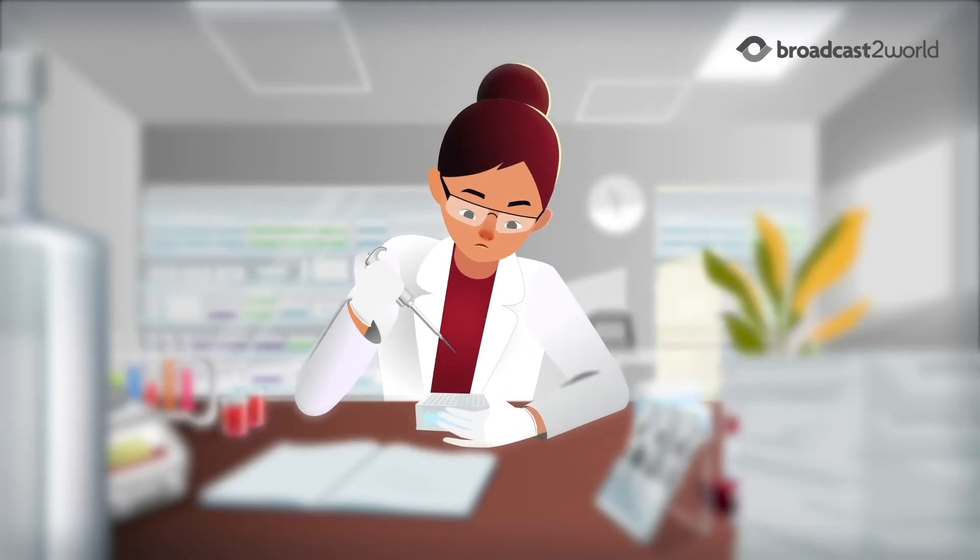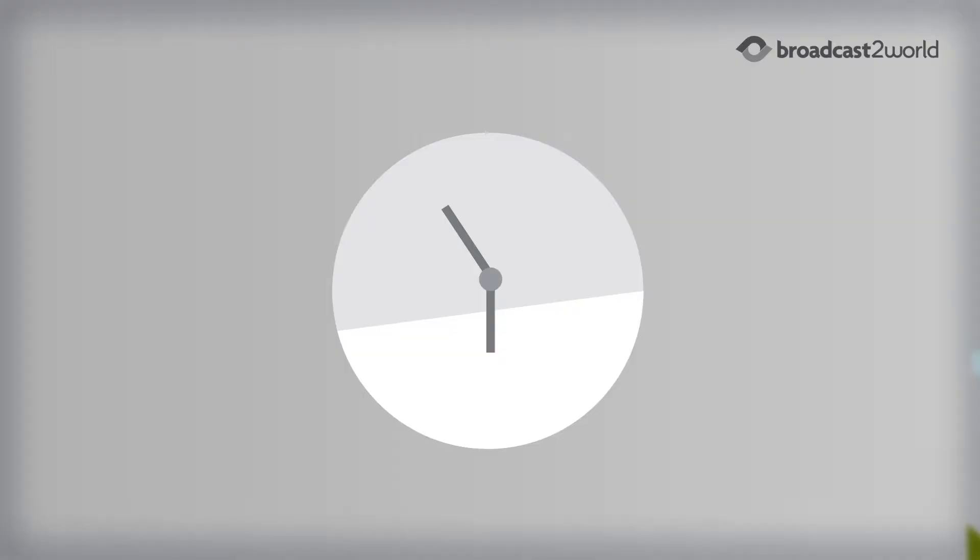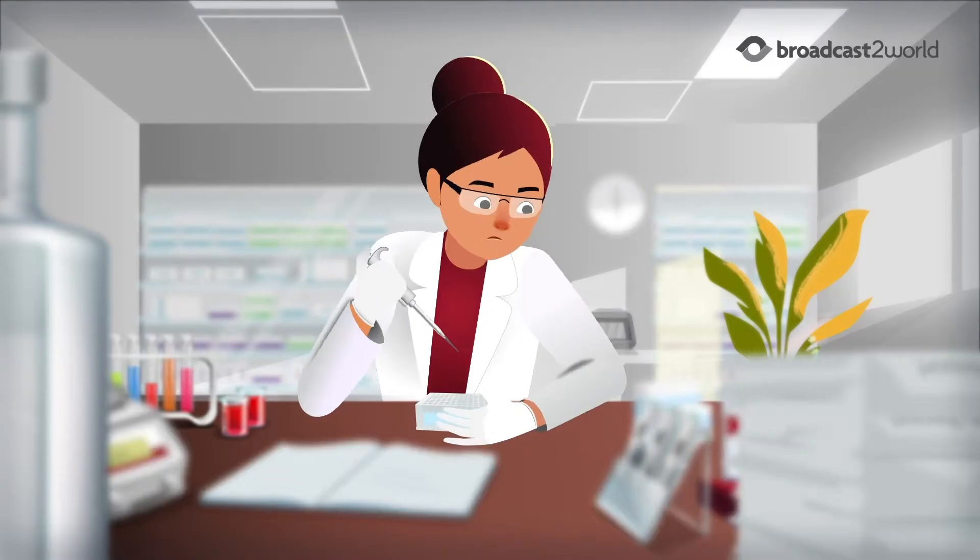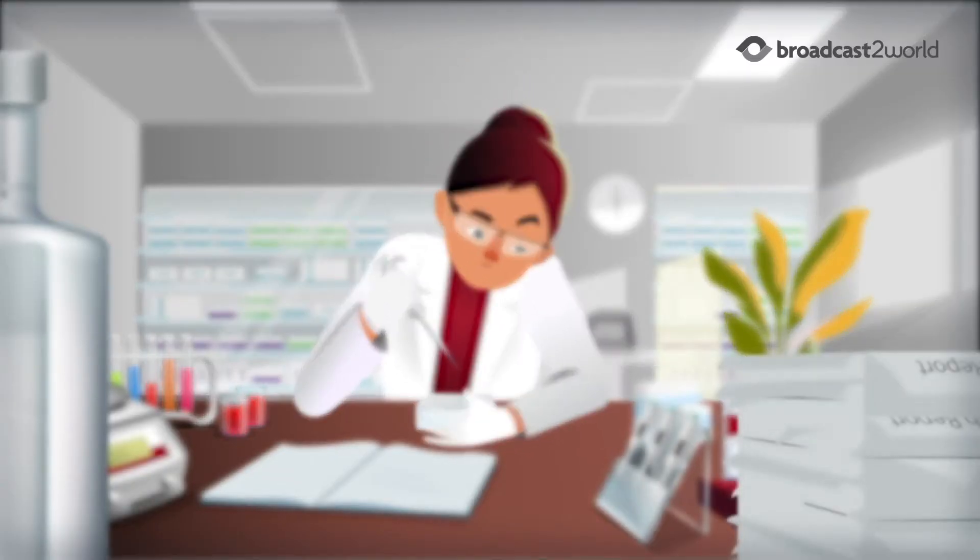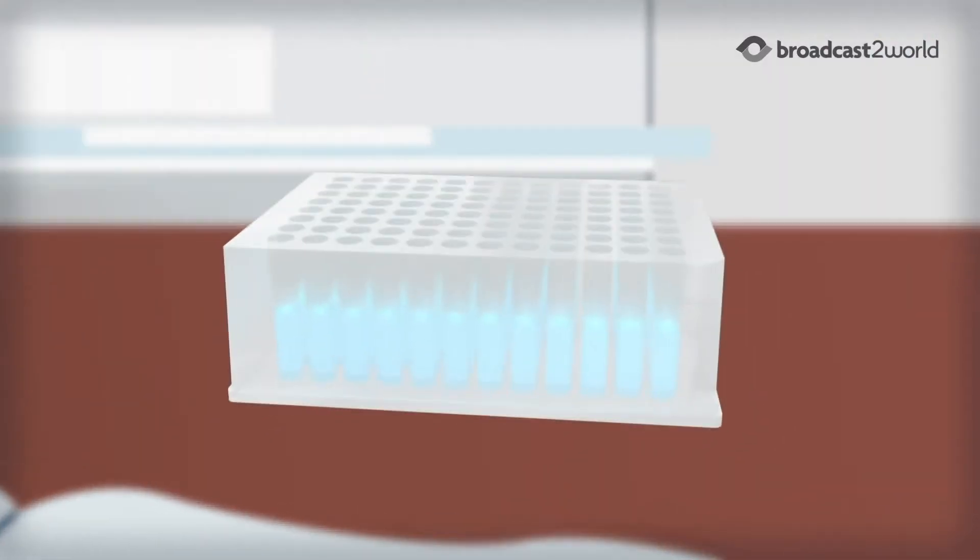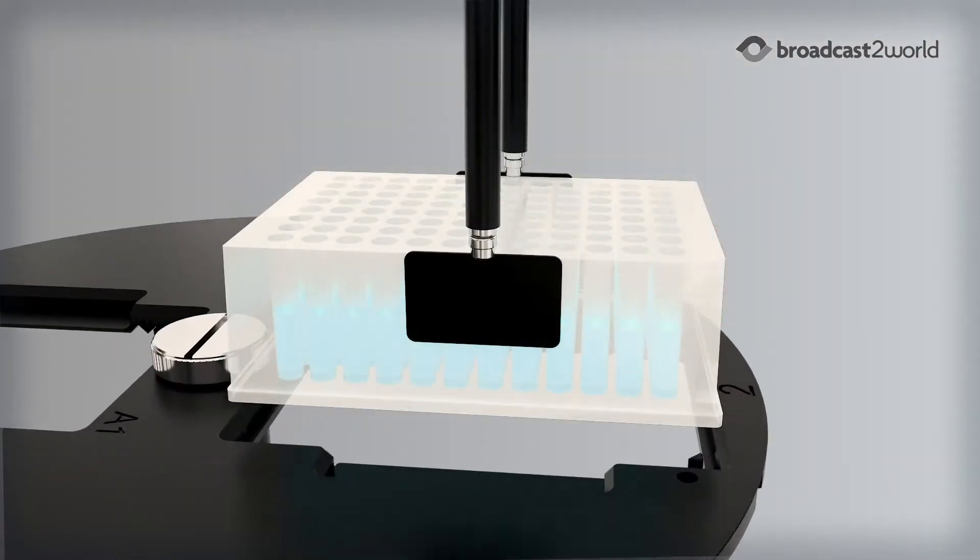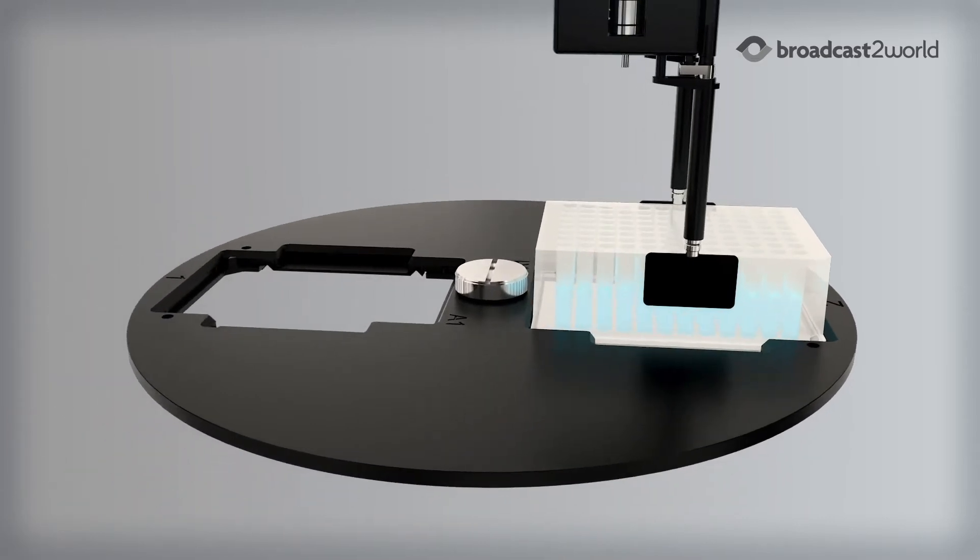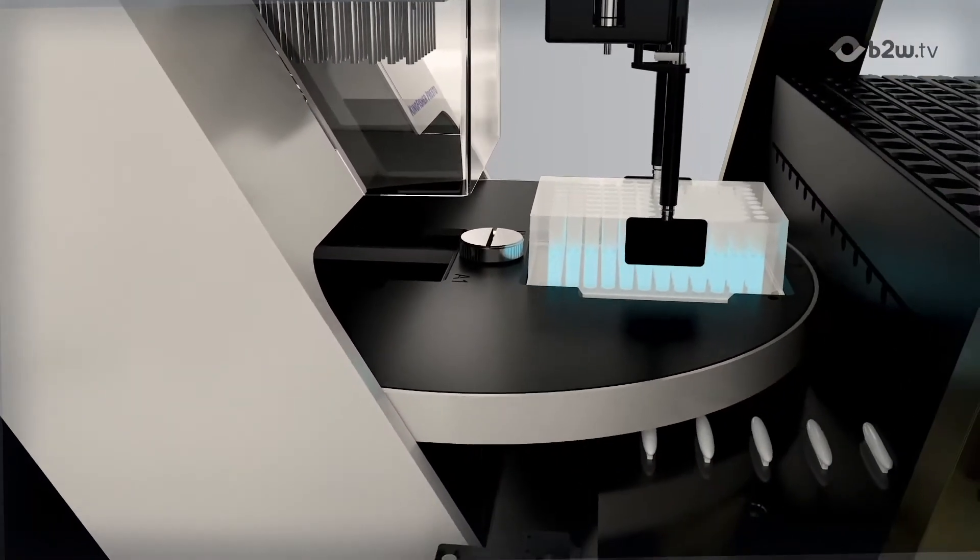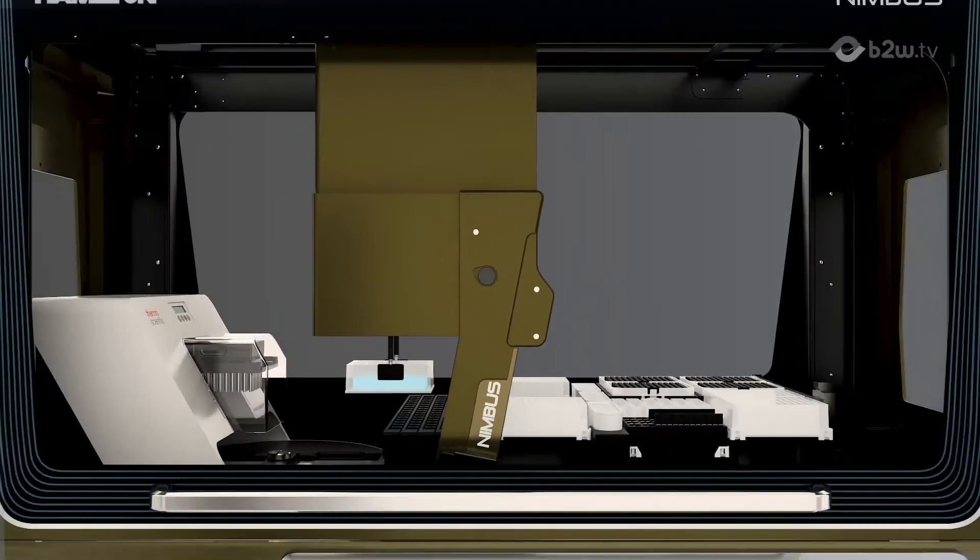Manual extraction of forensic samples can be highly variable and time-consuming, taking analyst focus away from more important activities. Automating the extraction and purification of forensic samples ensures high-quality, consistent results while allowing analysts more time to focus on more complex tasks.